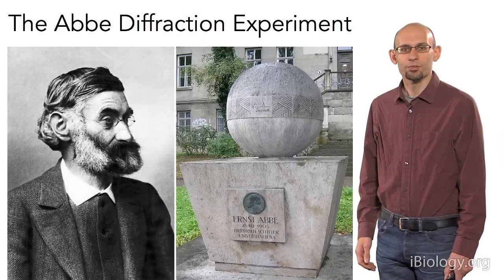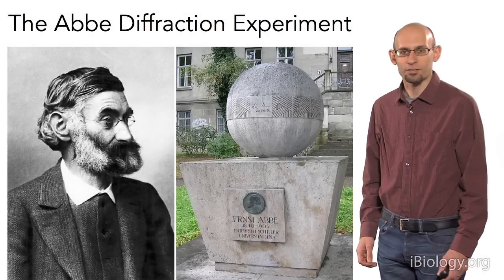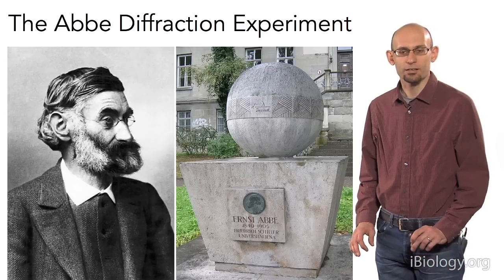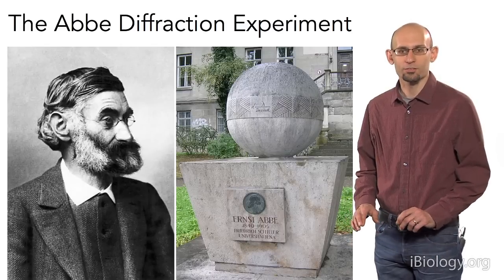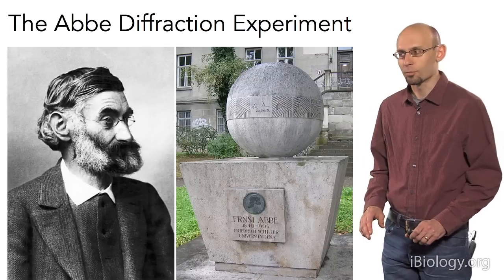I'm Kurt Thorn from UCSF, and today I'm going to tell you about a very famous microscopy experiment, the Abbe Diffraction experiment. And mostly we're going to be in the lab today doing a demonstration on a custom-built optical system. But before we go into the lab, I want to give you some introduction to this experiment and its historical background and what it shows about the microscope.